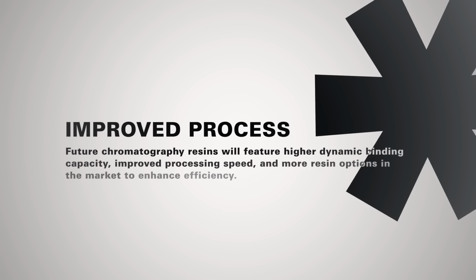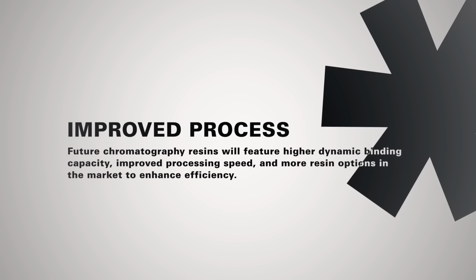But in the significantly near future, you can see a lot of improved processes. What do I mean by improved processes? It means that you can see more resins launched in the market that have a higher dynamic binding capacity, or that can work faster. They can absorb things more effectively.